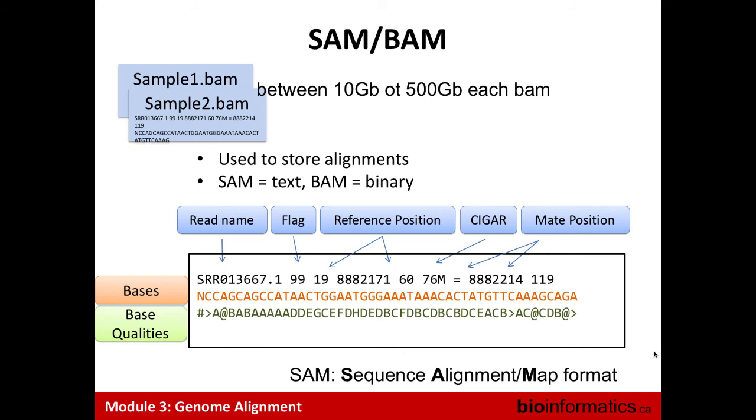Yes? Your CIGAR score, is that an average of your base qualities? No. It's just a description of the position of each base on the sequence.